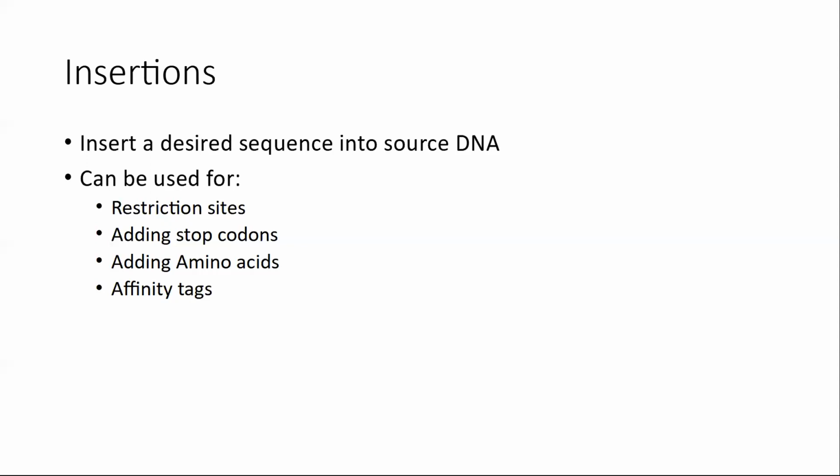So if you think adding in a histidine or something at a certain location will affect the gene in some way, that'll help with solubility or affect function, and so we would do that for it. Typically, if we're looking at affecting function, we're going to use substitutions, but this depends.